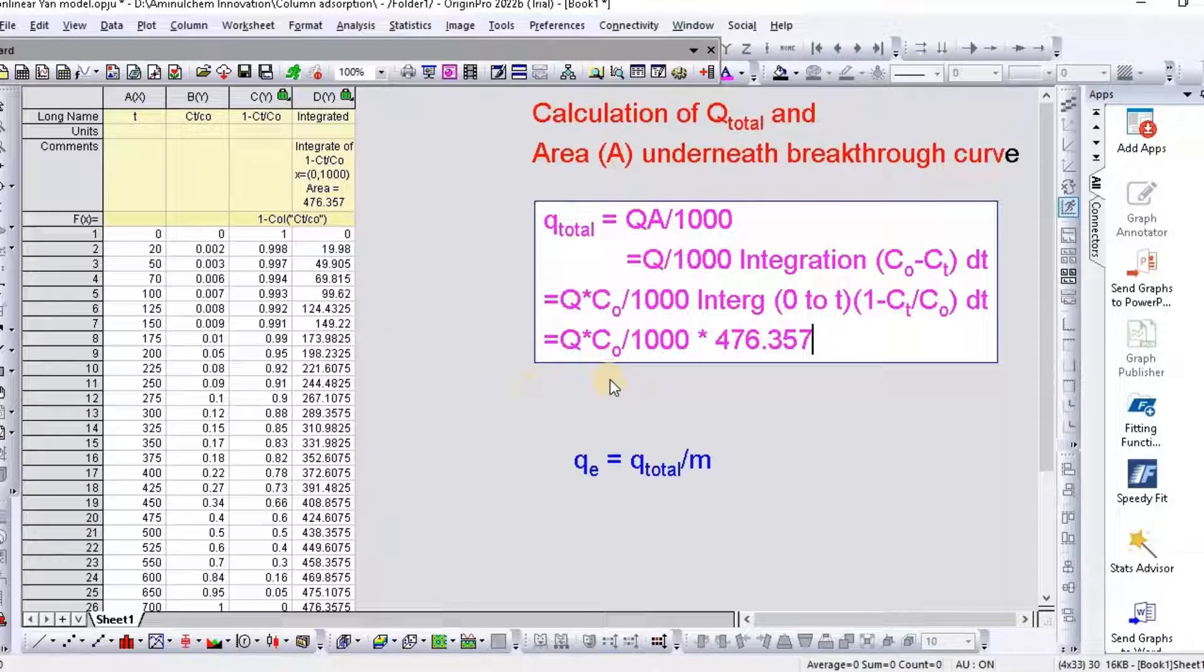So then you know the capital Q, which is flow rate, and then you can easily calculate Q total.